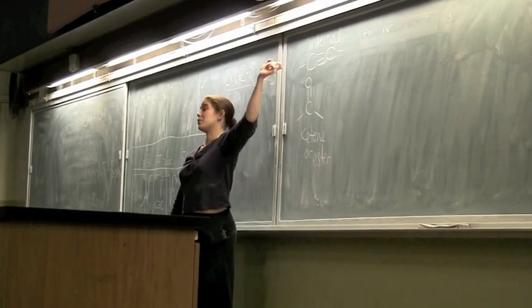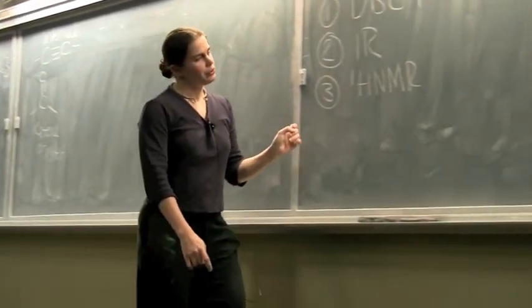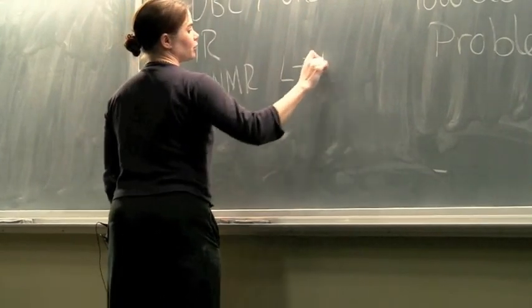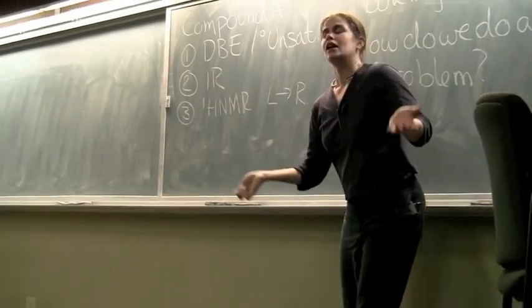We know we probably don't have a ring. If we find a ring somehow in there, something else is going wrong. So proton NMR, I really like to say again, I work it left to right. There's a couple of reasons for that. One, I grew up speaking English, it goes left to right.